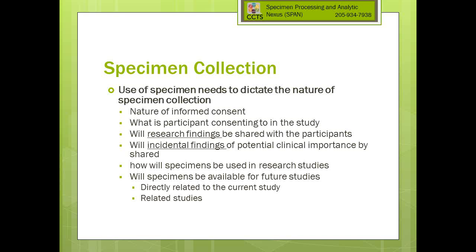Okay. So, again, obvious things, but something you need to think about. So the specimen needs to dictate the nature of your collection, right? So you need to make sure your informed consent is done appropriately.